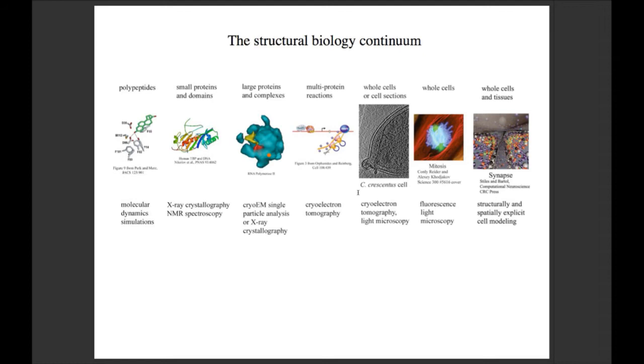He also talks about this structural biology continuum, and most of the time when structural biology is mentioned offhand, most people are referring to X-ray crystallography and NMR spectroscopy. And there's obviously this new resolution revolution that's put Cryo-EM at the forefront, mostly because it serves this really nice niche between high resolution structure determination and answering more of the macroscopic questions we have about proteins and how they interact in systems and in organelles, and also being able to target complexes, which tend to fall apart for crystallization for X-ray crystallography.